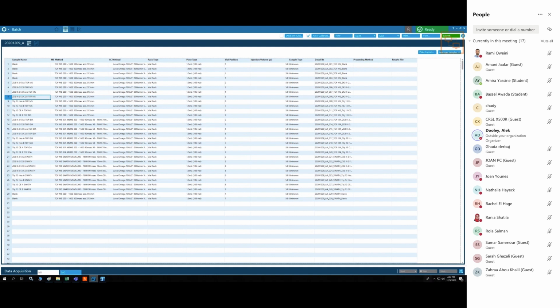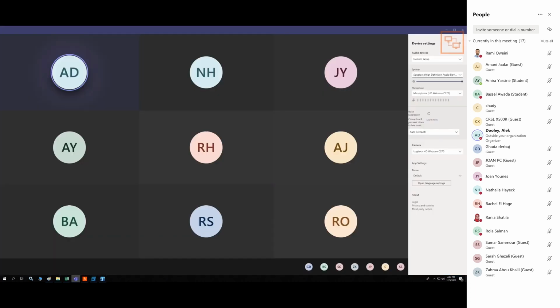So we're using 0.5 ml per minute, and we have 30 samples, and each sample is 21.5 minutes. So that is, yeah, you need about 325 mL total solvent for the whole thing. So you should be okay. We have currently 350, but we're adding them up to 650. Perfect. Actually, Alek, I wanted to ask you a question. Can we do some data processing from the Explorer end?